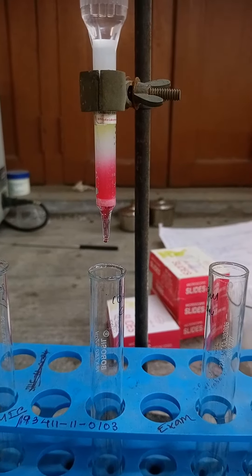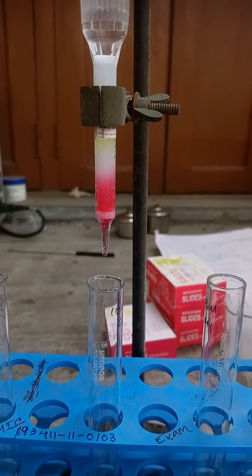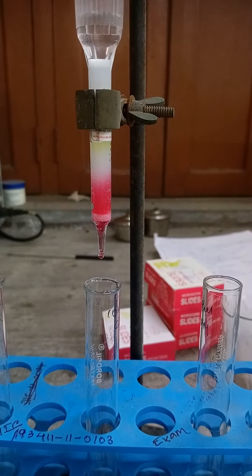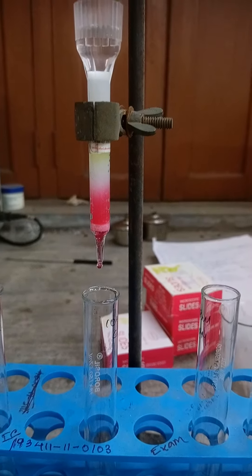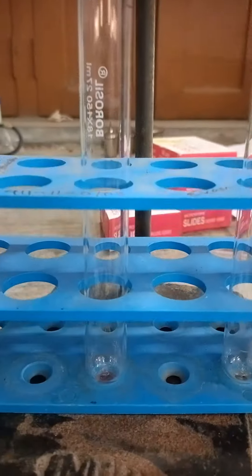Now we are collecting the pink colored fraction from the column, which is vitamin B12, about 1357 dalton. We are collecting this in a test tube.